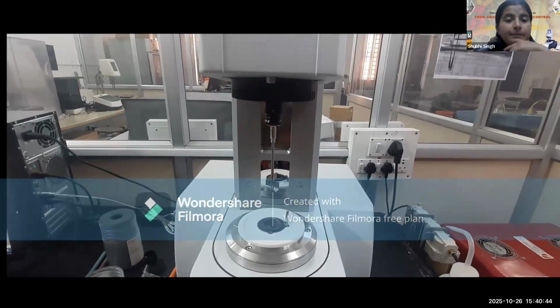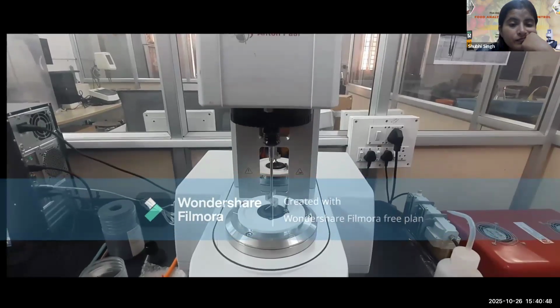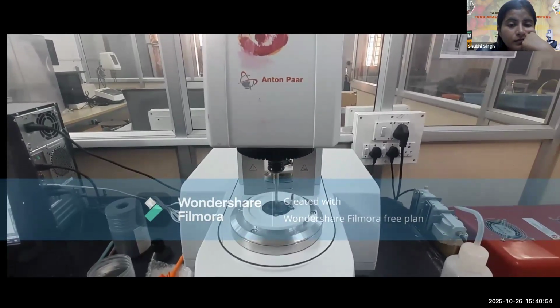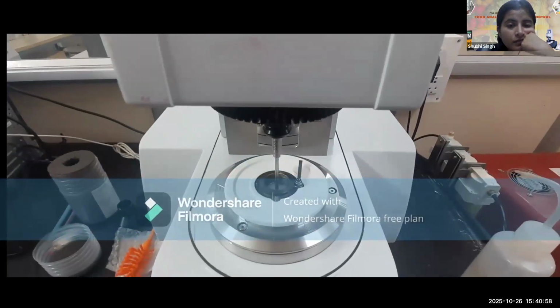The sample is put inside the canister. The probe is allowed to move downwards with the help of control panel, where it mixes with the starch sample with water. This process is known as pre-shear.